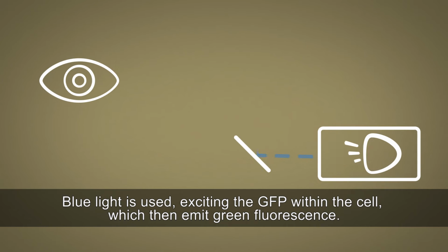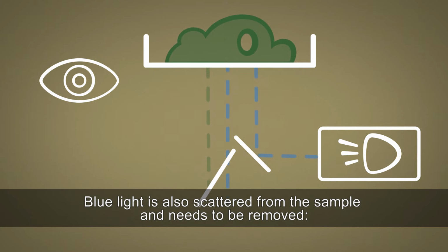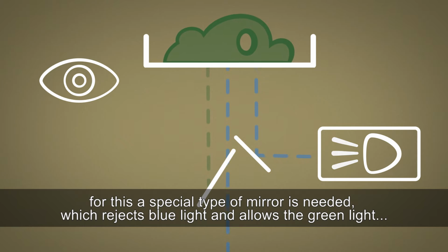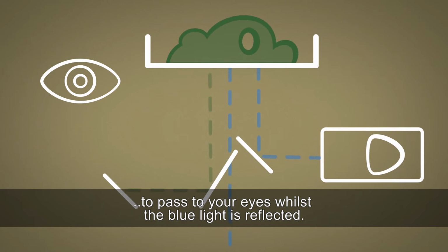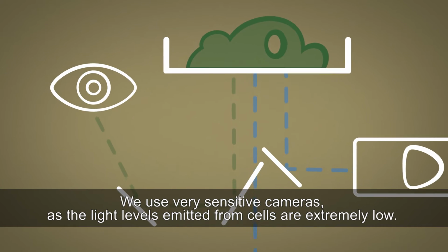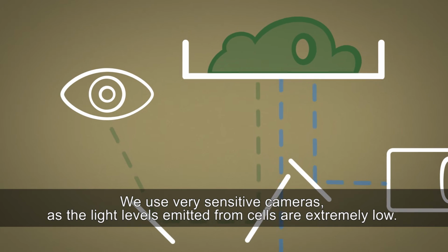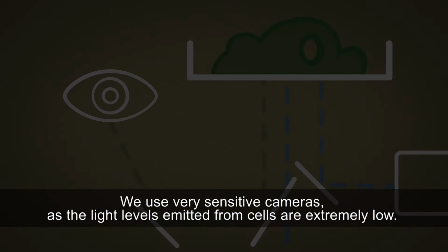Blue light is used, exciting the GFP within the cell, which then emits green fluorescence. Blue light is also scattered from the sample and needs to be removed. For this, a special type of mirror is needed, which rejects blue light and allows the green light to pass to your eyes whilst the blue light is reflected. We use very sensitive cameras, as the light levels emitted from cells are extremely low.